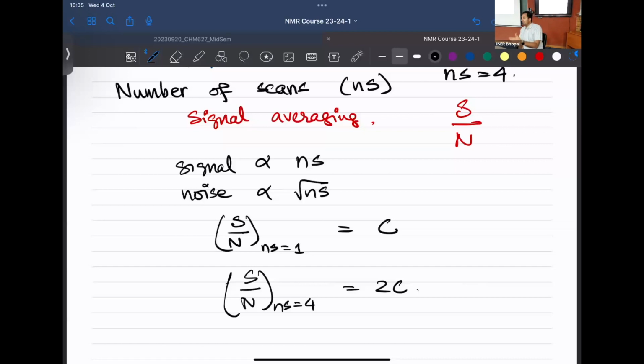Very similar to how I'm giving the lecture. I've told this point earlier. I'm repeating this point so that you already paid attention to the previous time. And when I'm repeating it, it gets reinforced further. Right? Or some distractions that happen keep reducing if I keep repeating 3 or 4 times. Similarly, is the way signal averaging also works in NMR. Your signals that come are periodic signals, meaning that if you keep co-adding them, they'll constructively interfere with each other. Since noise is random, more or less they destructively interfere with each other.